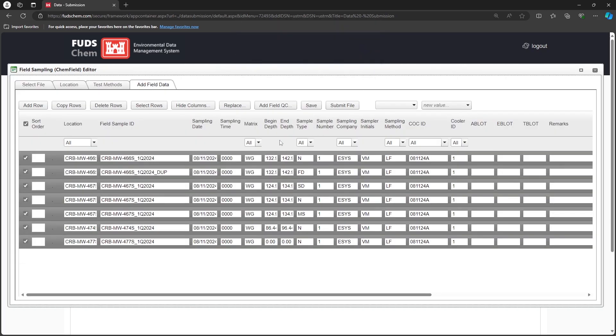Next, we will enter the times for each sample individually. All times should be entered in HHMM format.